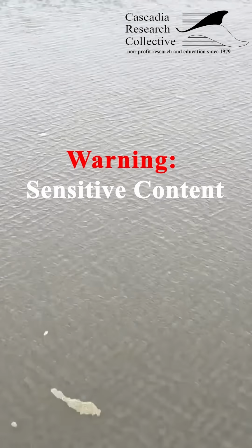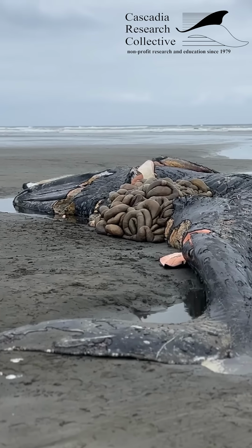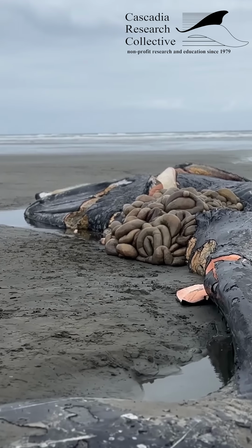Have you ever wondered what happens when a whale washes up on the shore? Follow along as we walk you through the basic steps of a whale necropsy, as performed by a small team of responders of us here at Cascadia Research Collective.